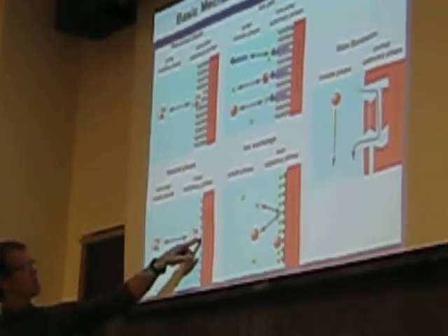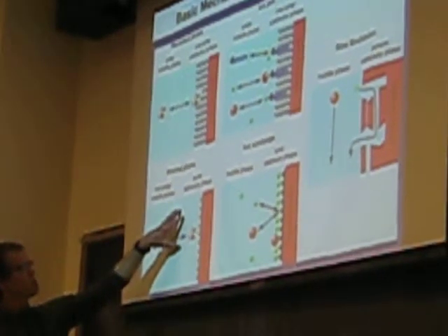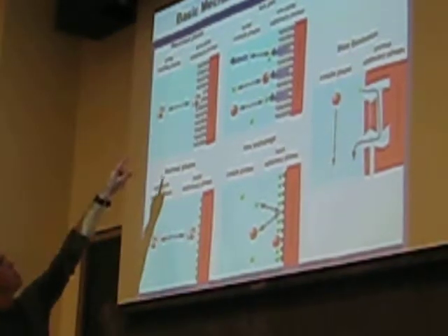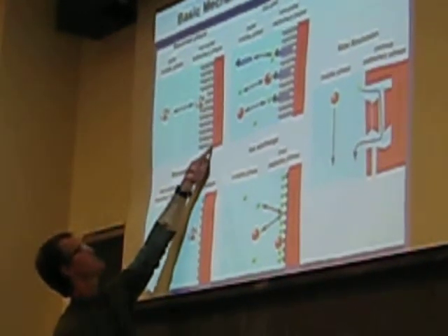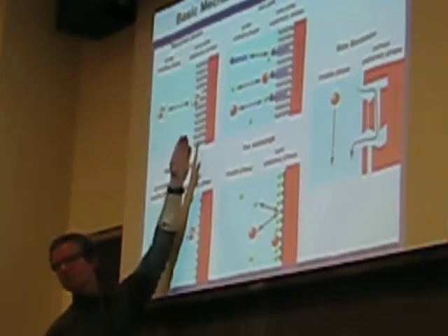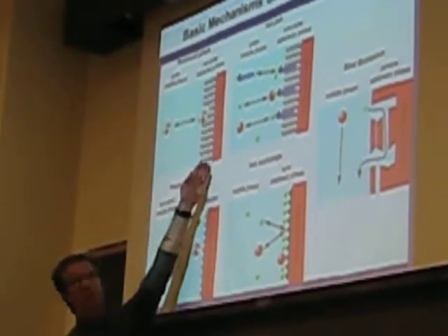It's going to partition with this polar stationary phase, depending on the chemical composition of the mobile phase and the stationary phase. In reverse phase, you now have, in this case, the C8. So you should name these 1, 2, 3, 4, 5, 6, 7, 8. There's a C8 column, and the C8 means you have an 8-carbon chain attached to this stationary bead. And of course, carbons are very hydrophobic, so in reverse phase, the stationary phase is nonpolar, obviously.